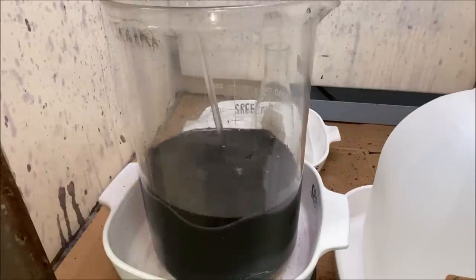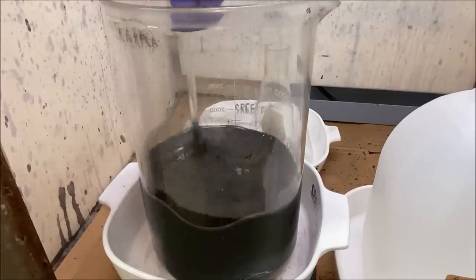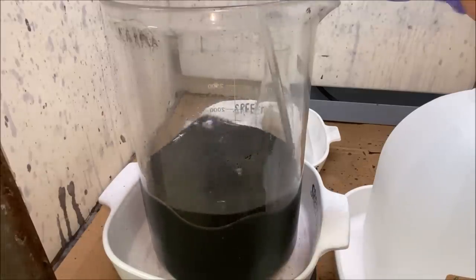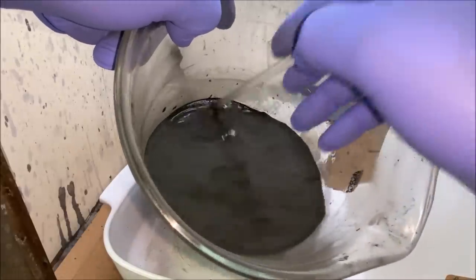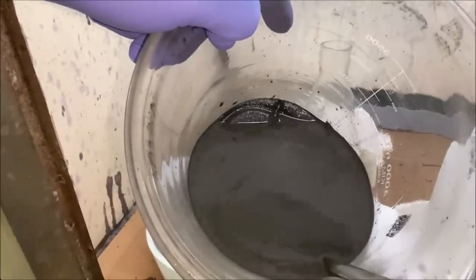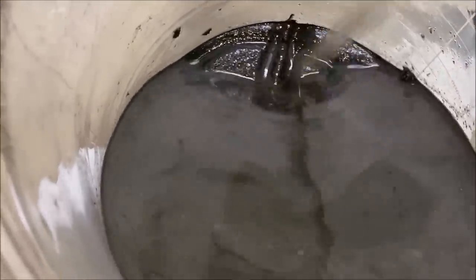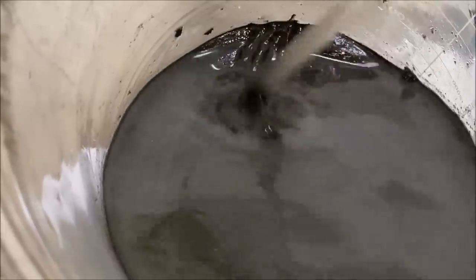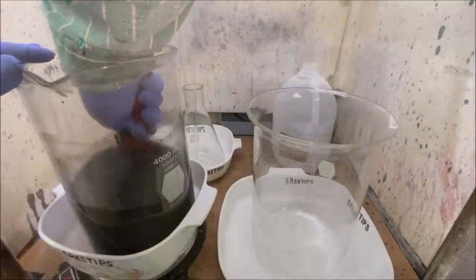Oh yeah, I can feel a solid bed of solids down on the bottom of the beaker here. It's like cement. Let's see if you can see down in there. See that? It's a solid bed of solids that's compacted, settled down in there in 2 days, so we're gonna have to get all that loosened up out of there.